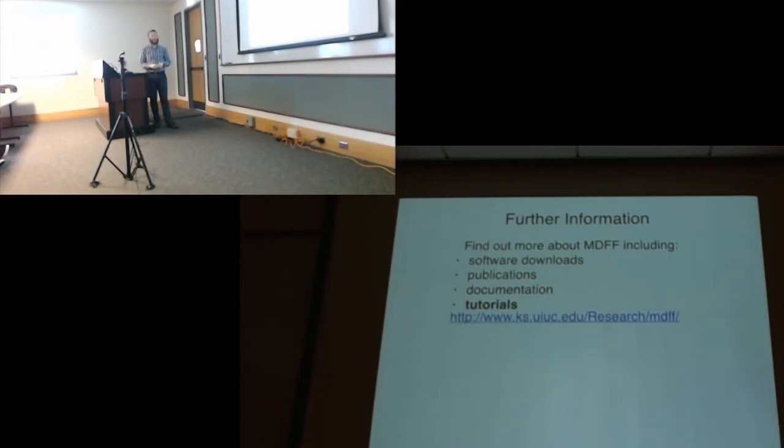I will say, one issue that you'll have there if you have ligands is parameterizing those ligands, because you are still doing an MD simulation, so you have to get the parameters for them.